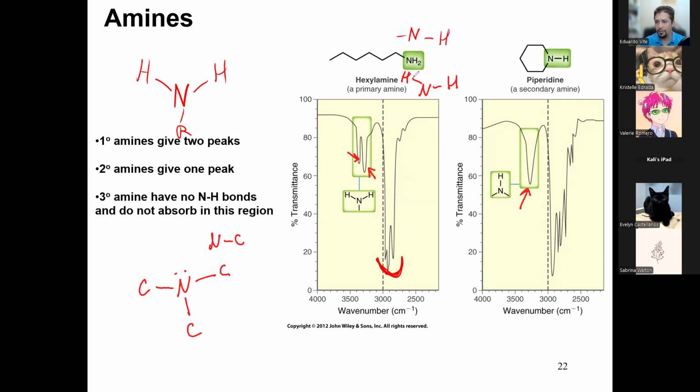It says, are there differences in peaks for isomers? Can you rephrase the question? I'm not sure what you mean by that. Are you talking about strength differences, wave number differences? Would the spectra look different? Oh, okay. So you're saying if two molecules have the same formula, but they're different isomers of each other, does the spectra look different? Yes, because the connectivity is different.